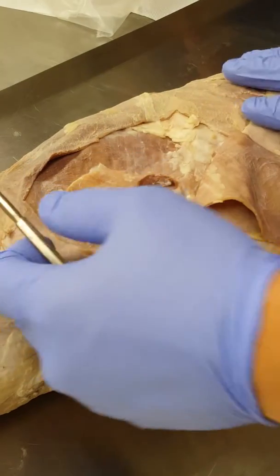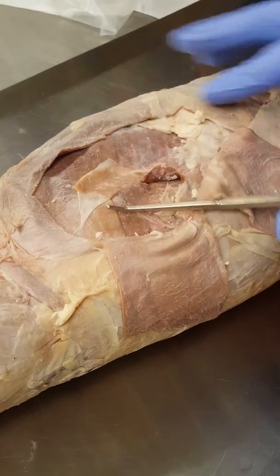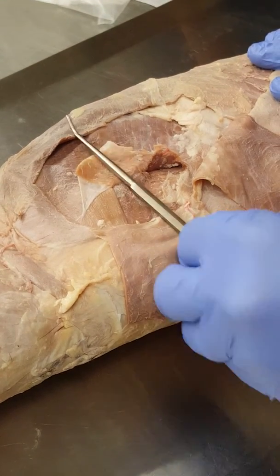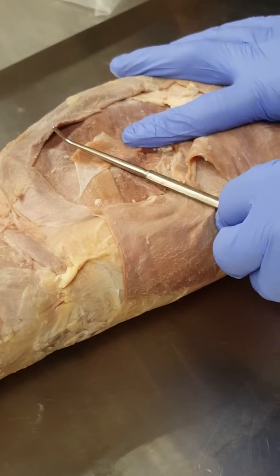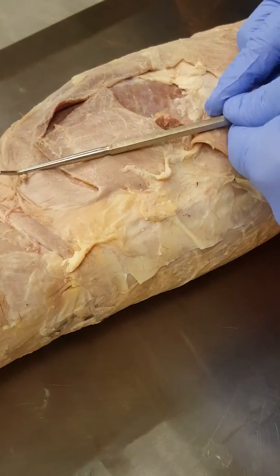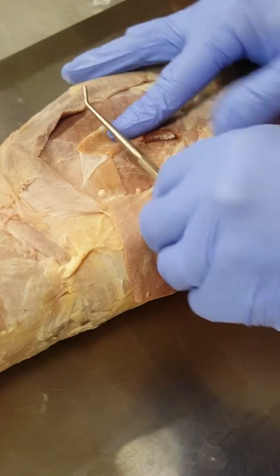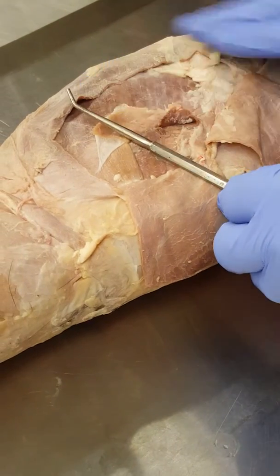Okay, so with the transversus, the fibers are not exactly the same as the external oblique. They don't go quite as far down, but they are just a tiny bit slanted. Ideally, they would go perfectly transverse like this, but a lot of times when you see them, they actually go just a tiny bit down like this. Okay? So remember, the external oblique comes down like this, the internal oblique is opposite, and then the transversus is supposed to be transverse like this, but realistically, it's a tiny bit slanted like that. Okay, so that's body wall there.